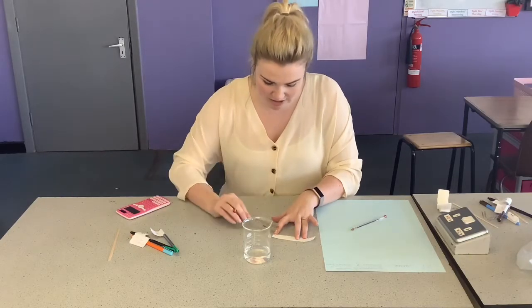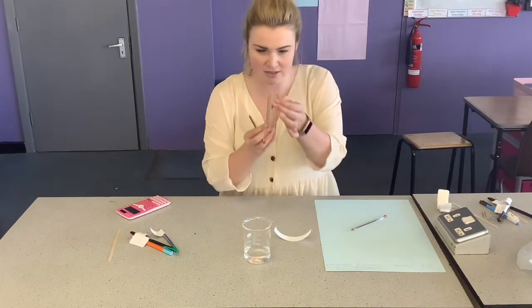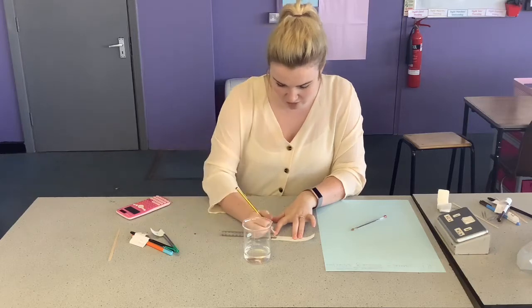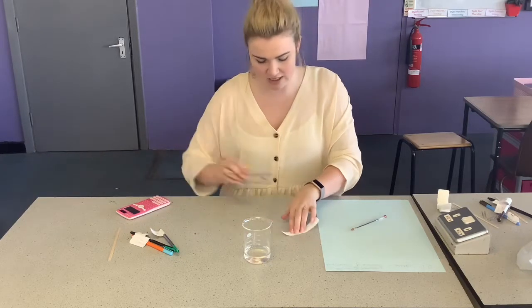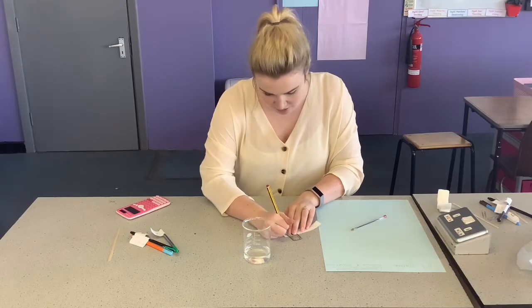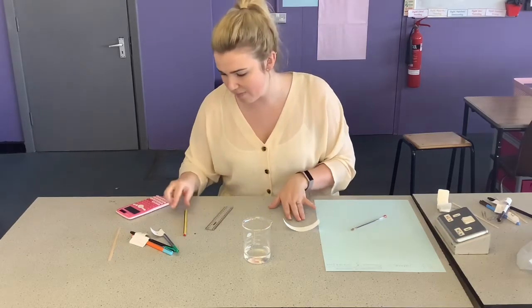So the first thing you need to do is draw a line one centimetre above the edge of the chromatography paper — a complete straight line. Make sure you're doing it in pencil, because if you do it in pen, then that will run and that will affect your sample.